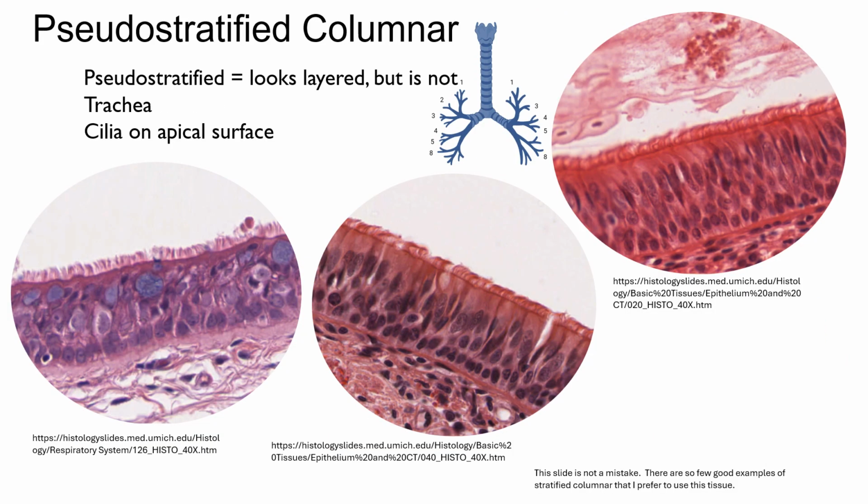You thought this slide was going to be stratified columnar. It's not. It kind of is, kind of. That's what pseudo means in the prefix of this word here. It's kind of stratified. Pseudostratified columnar has columnar-shaped cells, and they look stratified, but they are not. That's not many layers there. I know it looks like it, but it's not. The basal surface of each cell touches the basal layer, touches that basement membrane, which is like the barrier between the epithelial tissues and the connective tissues below it.